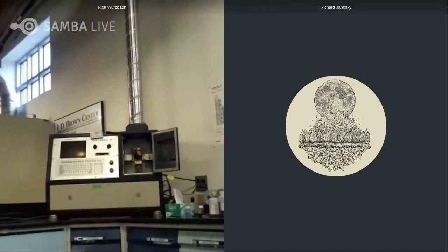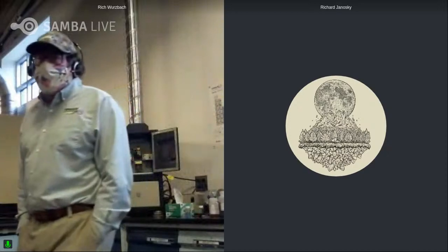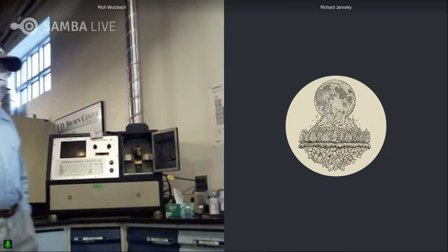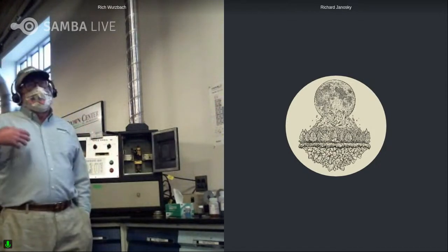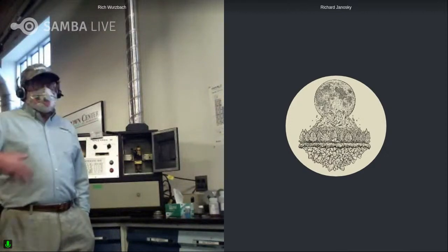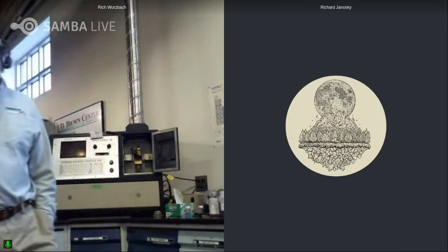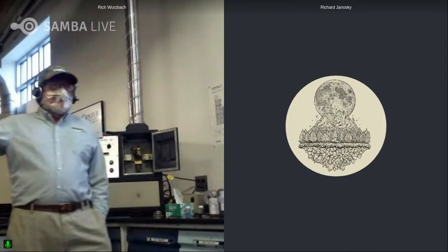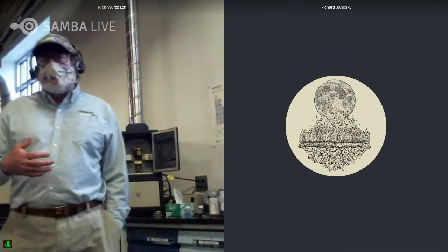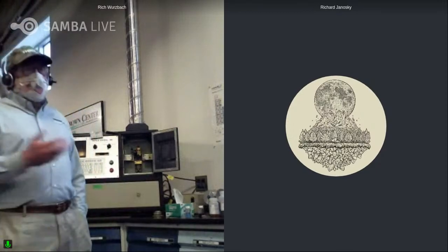Mm-hmm. Yeah, you mean in analytical ferrography, right? To be honest, analytical ferrography is where you find out whether you did a good job with your solvents or not. And it can be a moving target as well, because remember, we're not testing new grease. This is stuff that's been beaten up, and so sometimes there have been chemical changes already. Maybe there's been a little bit of mixing. Maybe there's been high temperatures. Maybe we even have what we might consider varnishing in oil happening in this grease. And when that happens, it might change and diminish the solubility of the things in that grease relative to when it was new.